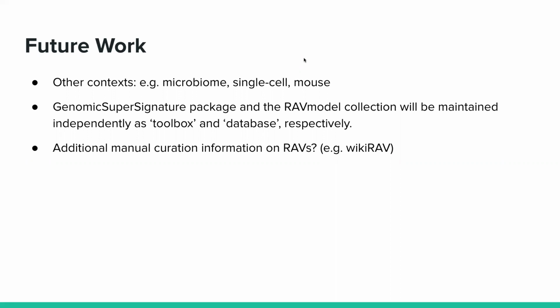And then I think when I look at the transformation and PCA, people do PCA for microbiome data a lot, right? But currently there is this centered log ratio transformation that people seem to apply. So you would maybe exchange that instead of the shifted logarithm that Seon applies, right? And there are a few options.